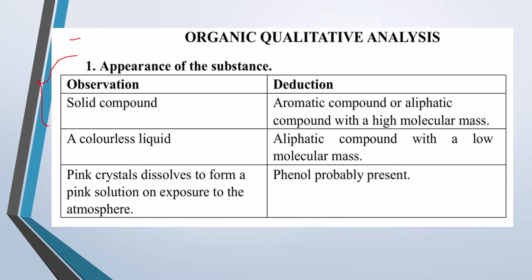Then later we are going to handle solubility, and then we handle the effect on litmus paper, and then later we handle how each and every reagent is going to be treated with our substances that must be distributed in the laboratory.